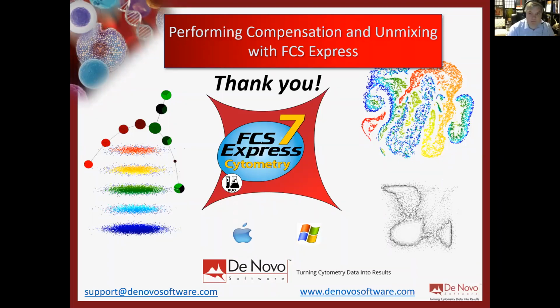One thing that Rui and myself are both very strong proponents of is making sure that you have the appropriate controls and always taking a look to make sure that from a technical perspective, you're all set. One of the things that people often ask, that I see no one asked today, so I just want to address it while we have our audience, is sometimes people ask about making tweaks to compensation or unmixing.